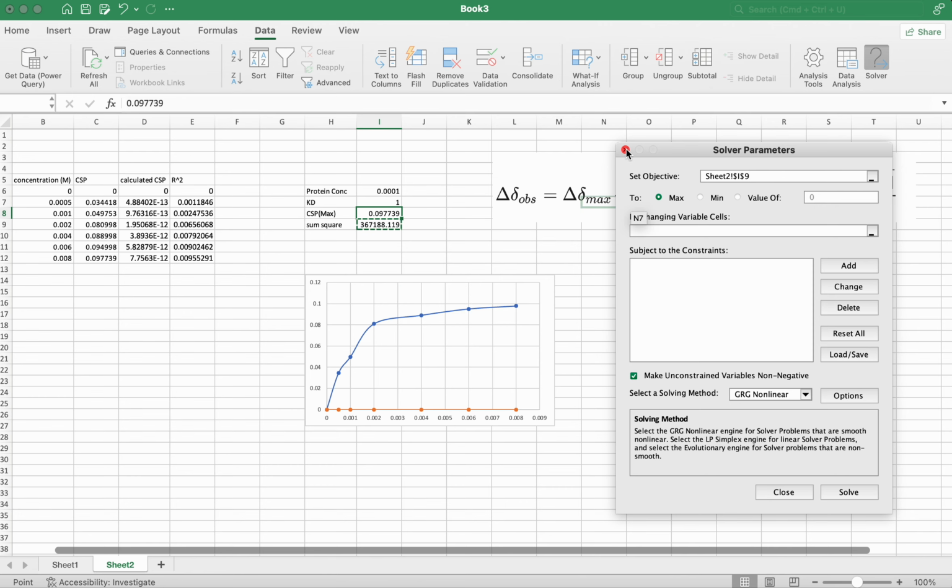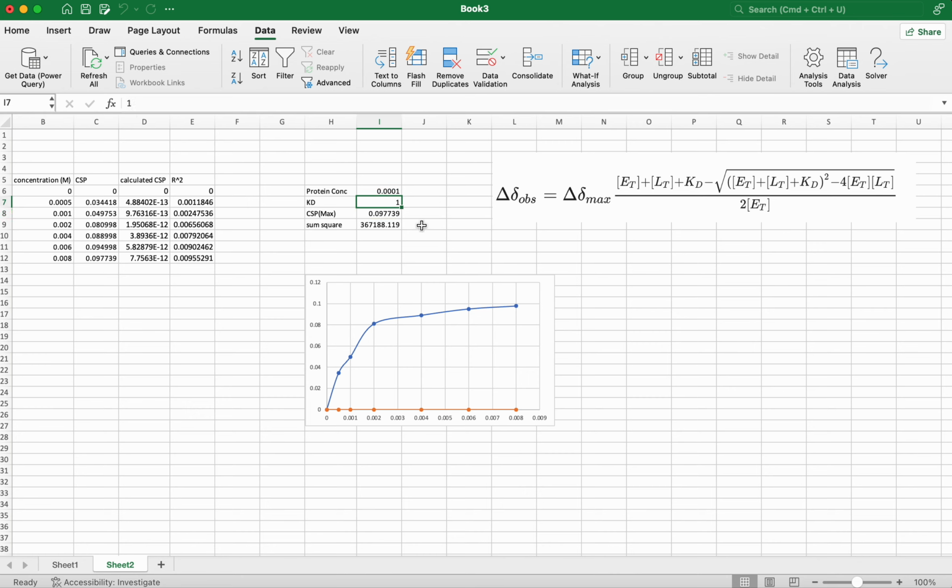For example, before fitting I can show you something, let's close this. Now I have Kd 1, and if you expect Kd is a smaller one, like 0.5, and still it's not changing. Maybe it may be a different value. We can try to fit and get that value.